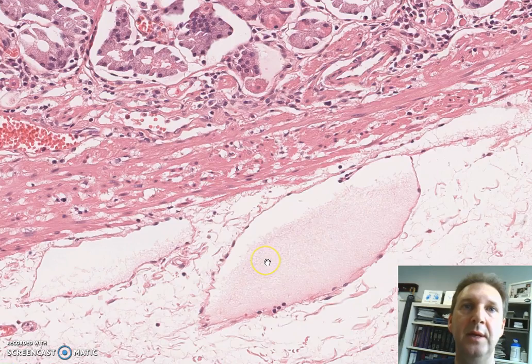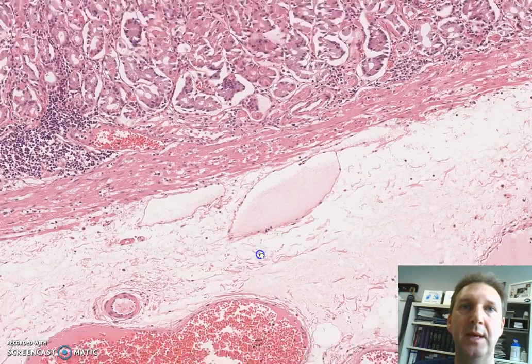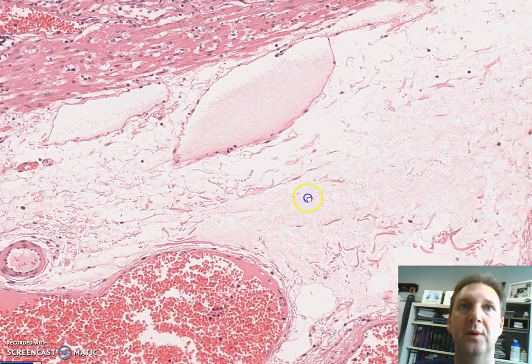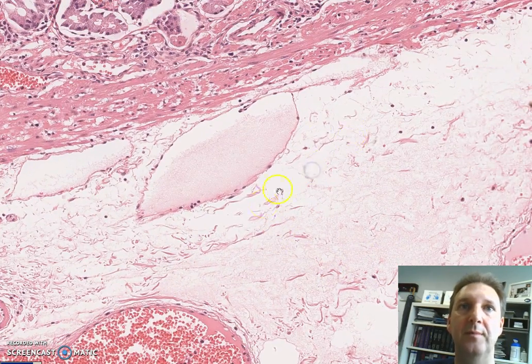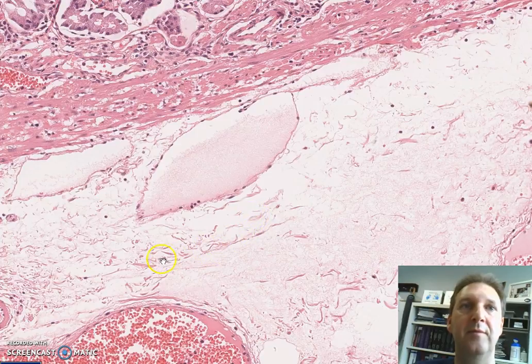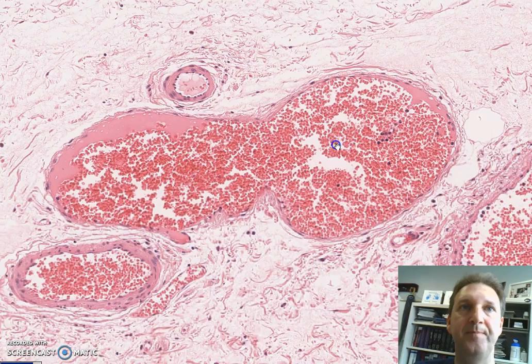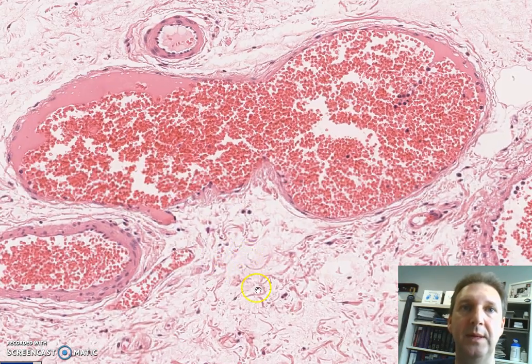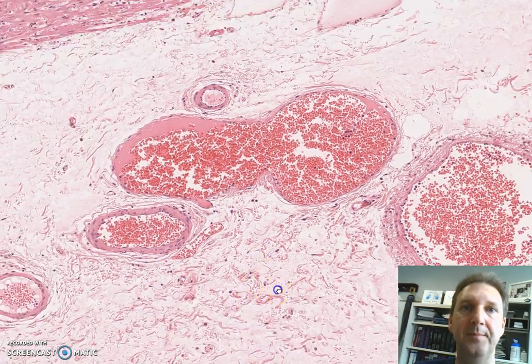Right underneath we have the submucosa, composed of thin fiber connective tissue with blood vessels with red blood cells inside.